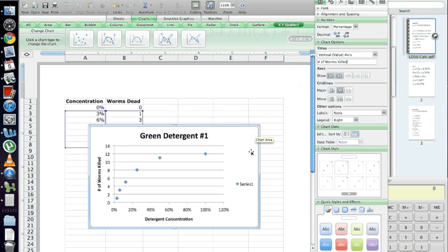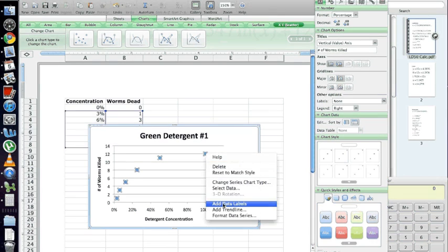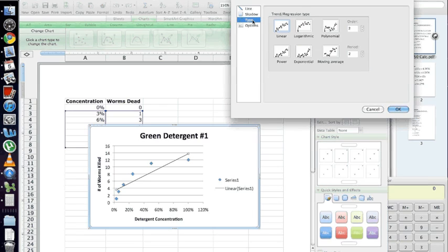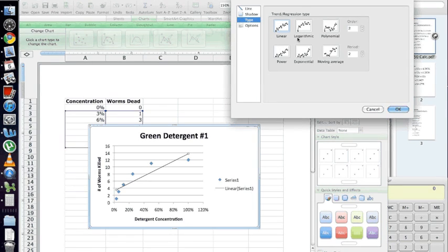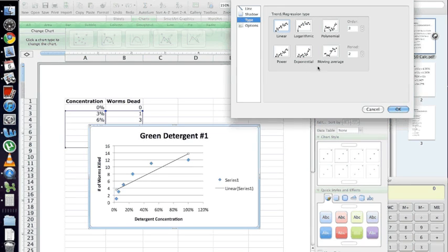Once we have all that in there, we can add our trend line. Go ahead and select a data point, right-click on it, add trend line. Go to type, and you're going to want to choose one of these three: linear, logarithmic, or exponential. Don't use the others, because the equation it gives you will be too complicated to calculate your LD50.